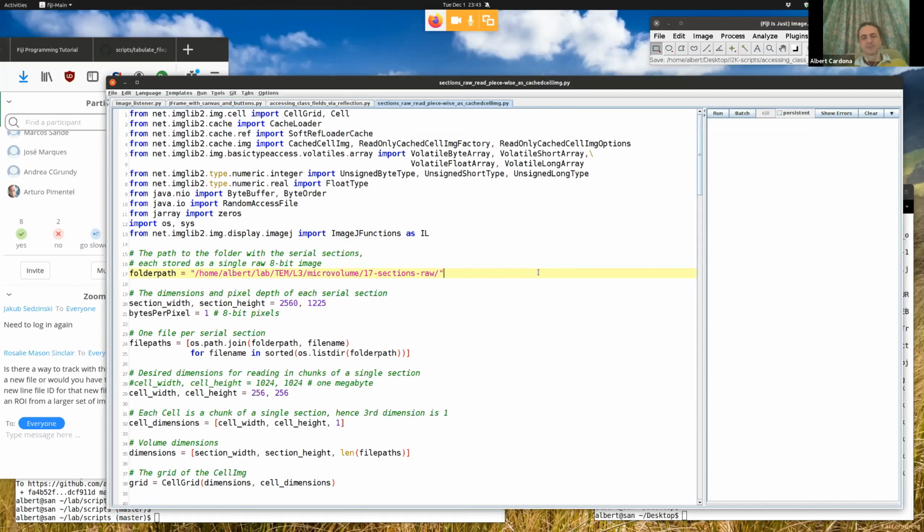It takes time. And then the microscope can be configured so that it saves the images raw, which you should always prefer in most of these microscopes, because if you try to compress with TIFF or whatnot, the high frequencies of the image in electron microscopy are so high that the compression is basically null. It just adds overhead. And if you have it raw, then you have the ability to load chunks of the image really fast, because the bytes on disk are the same as the bytes of the image on the screen, and it's a one-to-one mapping.